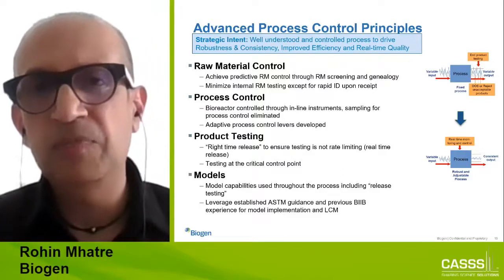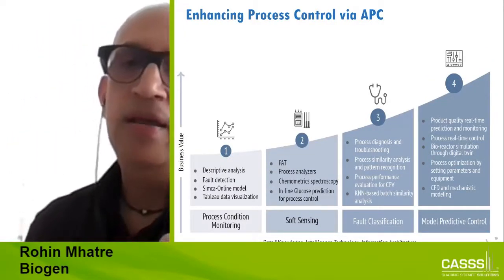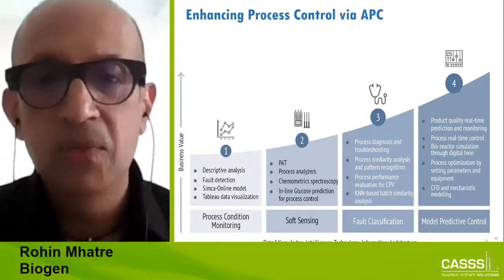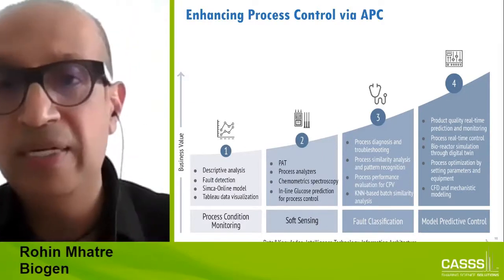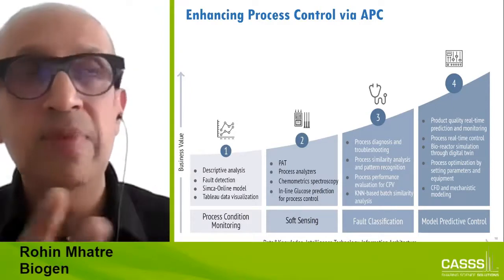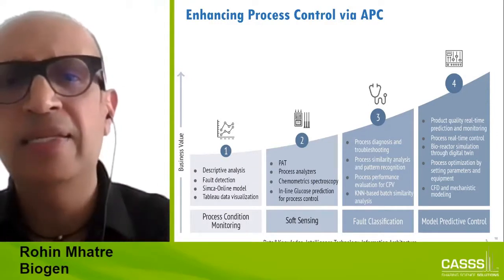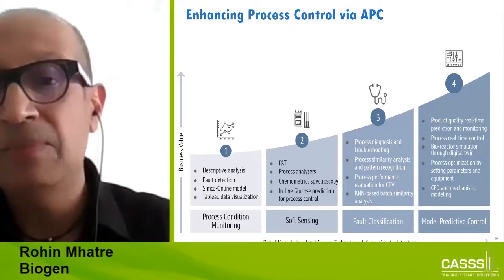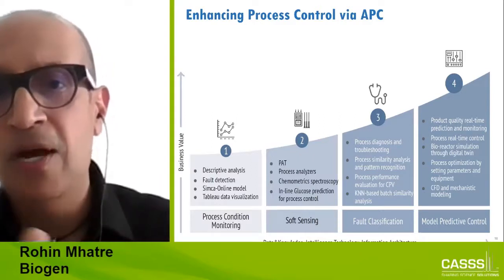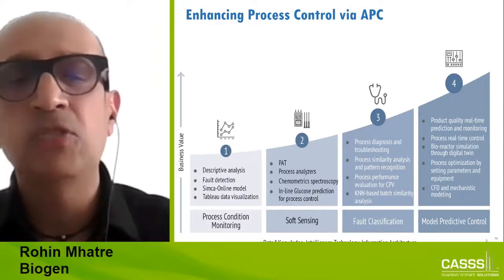And that's the principle that we're operating under. Just want to quickly show you the evolution of models. A number of you who are far more well-versed in this than I am would recognize and appreciate this, but it takes time. For folks looking at implementing this, whether you generate incredible mass spec data and use that to model things, it is a journey, and sometimes the models aren't perfect, and one has to be realistic about it. You may have to cut your losses and move to a different approach, but to a large extent, what we have seen is the models have actually served us well.